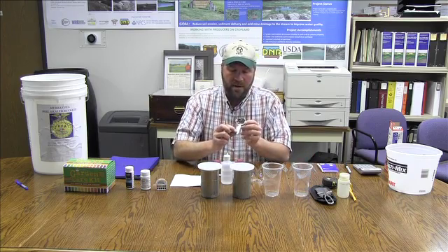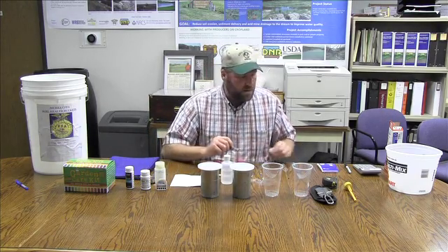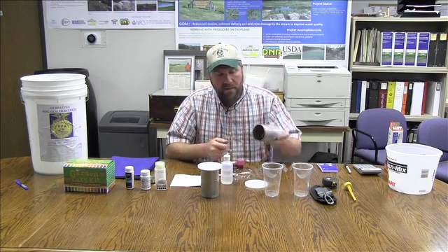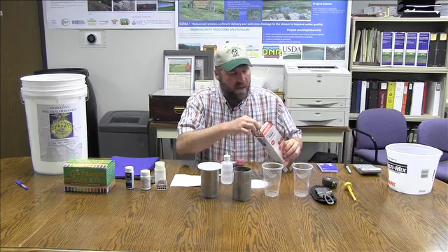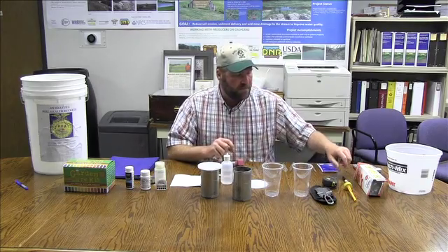There is a one eighth measuring cup to ensure a one to one ratio when doing the chemical properties tests. A small butter knife with a little serrated edge is used to clean off the bottom of your bulk density sample — you just scrape that away. There are zip lock bags that you could collect your bulk density samples in, and a marker to write where those samples come from and the dates.